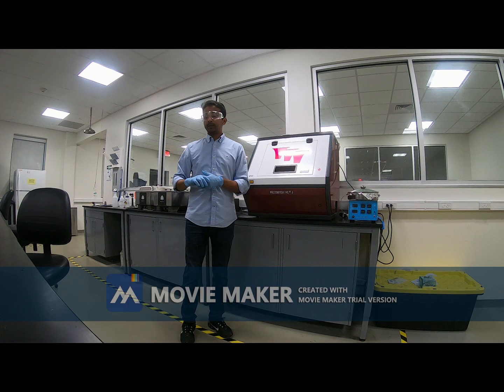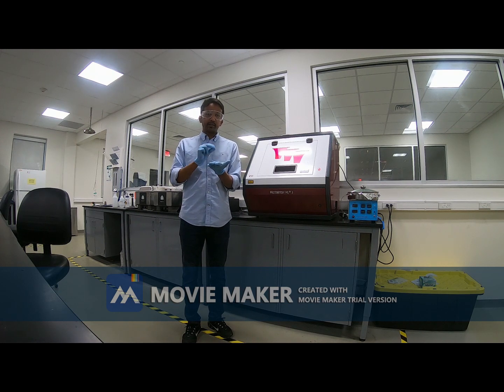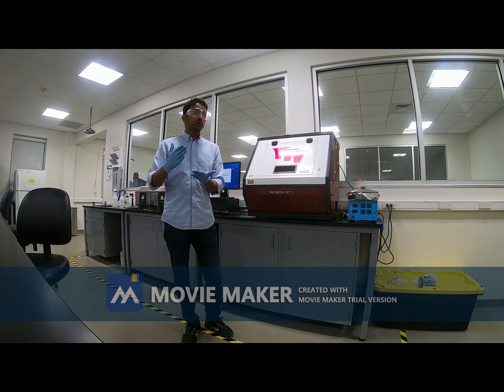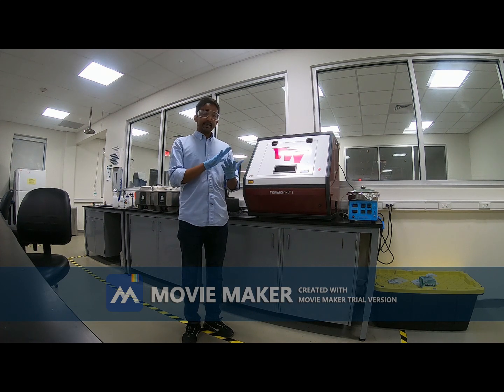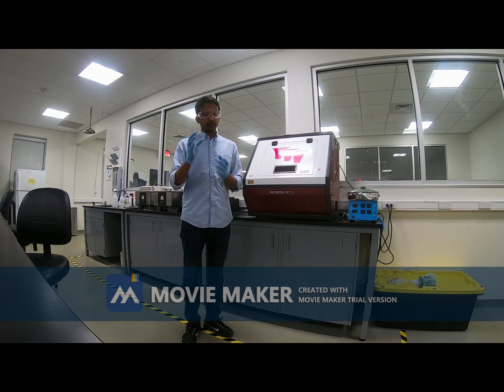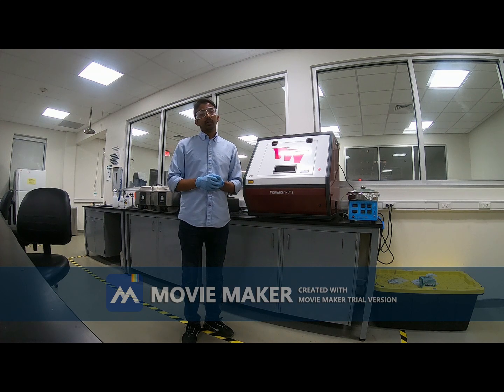Now after the development, as I said before, we will see that most of the photoresist is removed, and we will see the pattern on top of the silicon wafer. So this is the end of photolithography, but if we want to etch some materials, then we can do the etching, and for etching we use different types of etchant. For silicon, silicon dioxide, chromium or some other material, we need to use a particular type of etchant. For example, chromium has chromium etchant, silicon has silicon etchant. So etching agents or etchants are also chemicals that are particularly made for that particular material.